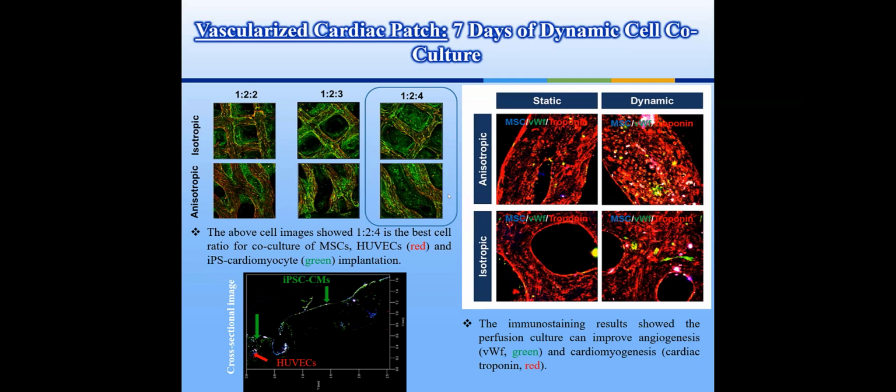For tissue engineering research, another very important one, especially for larger tissue and organ regeneration, is the bioreactor system. I'm not sure you heard. A bioreactor is kind of a chamber. You can control the environment, oxygen, carbon dioxide. You can control the flow rate. It mimics the human body environment. You can also apply a lot of stimulation into the system. We also consider that a dynamic culture system. So we also found that in a bioreactor we designed in our lab, the cells can differentiate much better when compared to a static culture, just putting them into a dish.